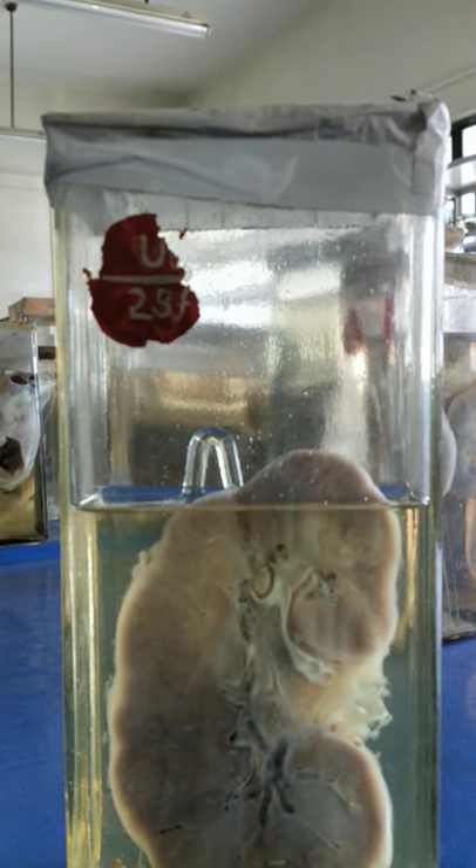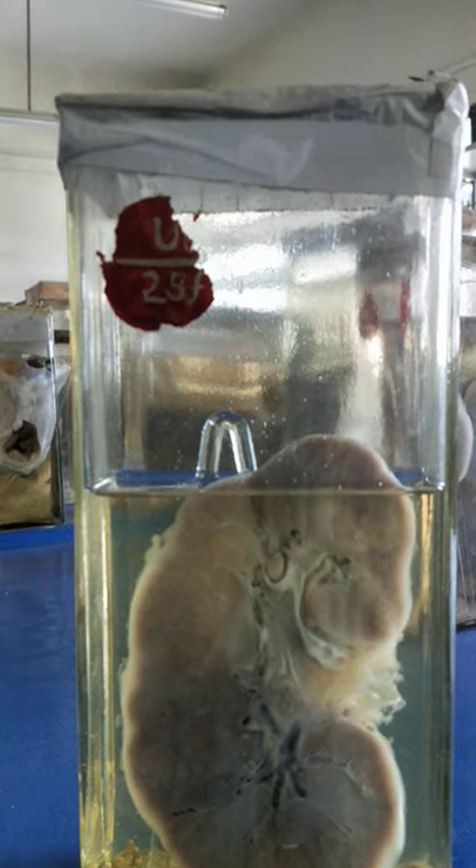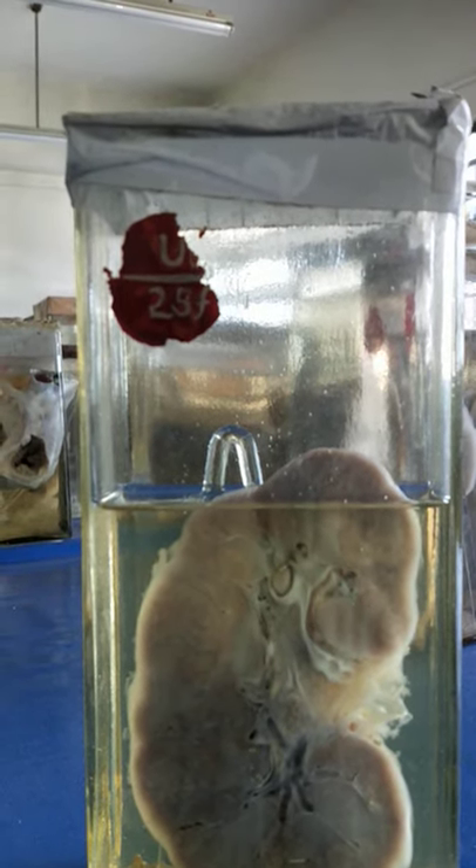Corticomedullary differentiation is present. So this is a specimen of large white kidney.